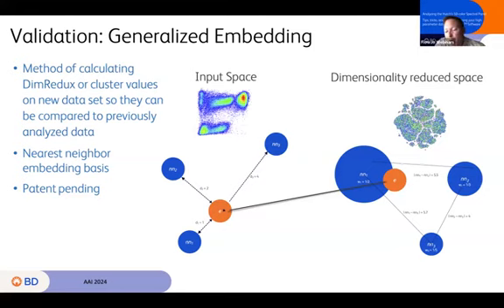It also gives you an input quality and an output quality score, which I think is really important because we will always find the nearest neighbors to a cell, but how near were those nearest neighbors? So input quality tells you in the input space how close they were. Output quality shows in the output space how close they were, so that you can either use those extra parameters to filter out things that just weren't well represented and mapped poorly and gate them out, or gate on them because they are the cells that weren't there in the original data. And so maybe whatever you've done to perturb the new data set has produced this result. And so it gives you a way to selectively see which cells map best and worst.